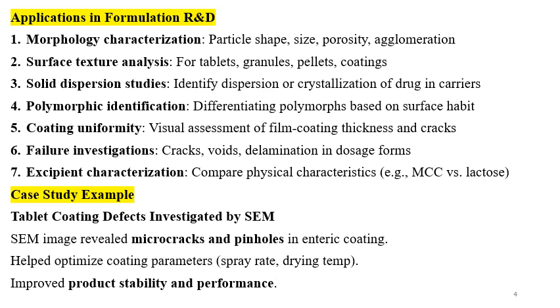You can do reverse engineering of the reference formulation or some formulations, and you can improve the formulations by using SEM. Failure investigations. Cracks, voids, delamination in the dosage forms can be visualized and studied. Excipient characterization. Compare physical characteristics of the excipients and APIs by the SEM. Example here I have taken for easy understanding.